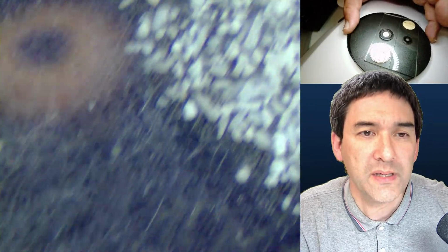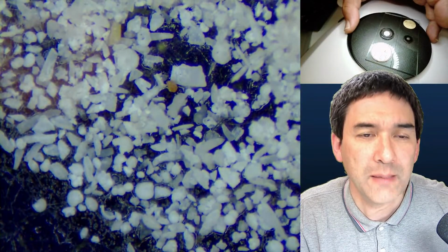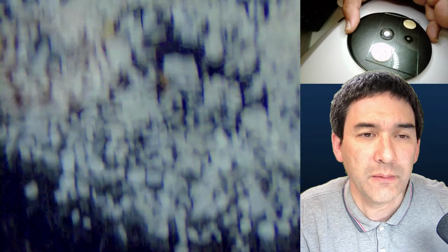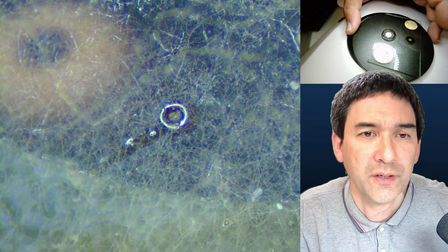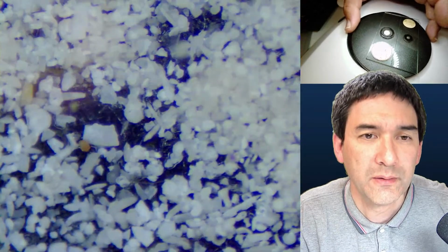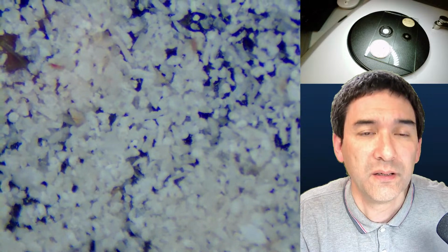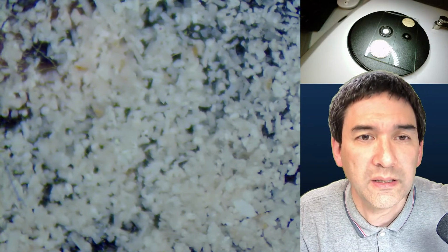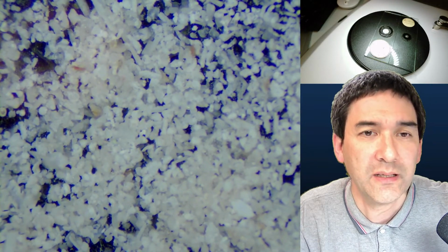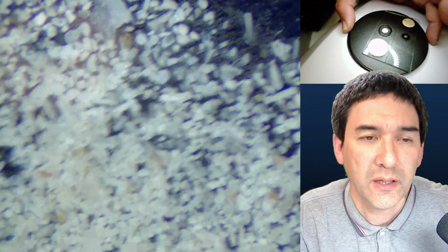it's not always suitable for image editing. For example, right now, it looks fine. But if I go quickly over here, you see how the background becomes brighter, and how it adjusts the exposure time. Okay, so if you need maximum control, then maybe these cameras are not the ideal thing, but it's perfectly suited for live streams because I do not have to worry and keep on adjusting it.